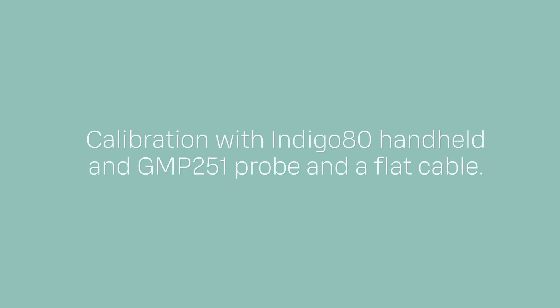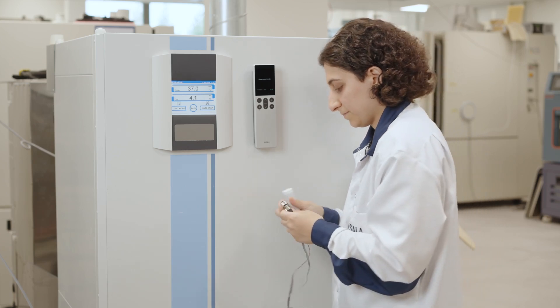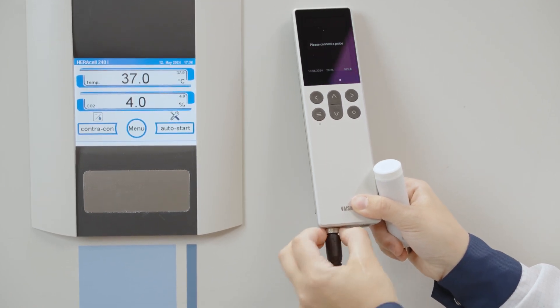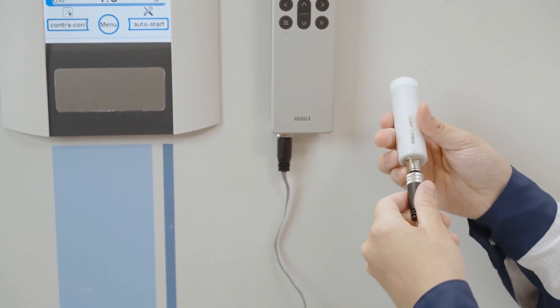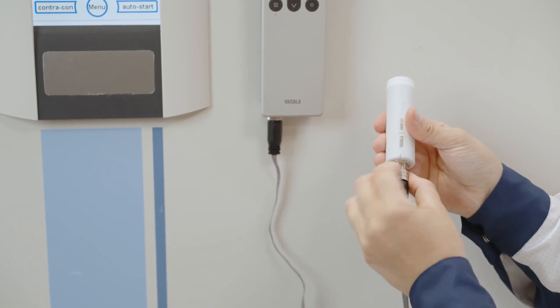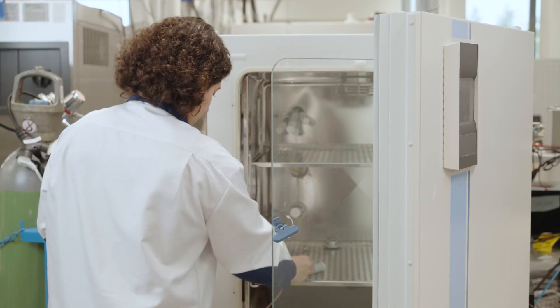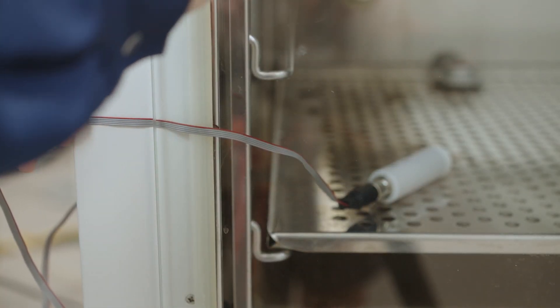The first way to do an on-site calibration of CO2 in a working incubator is to use the Indigo80 handheld and the GMP 251 CO2 probe with a flat cable. Make sure that the GMP 251 probe connected to the Indigo80 corresponds to the incubator measurement range and is freshly calibrated. Also use a flat cable between the GMP 251 probe and the Indigo80 handheld. Let's insert the GMP 251 probe into the incubator — by using a flat cable you can close the door tightly.